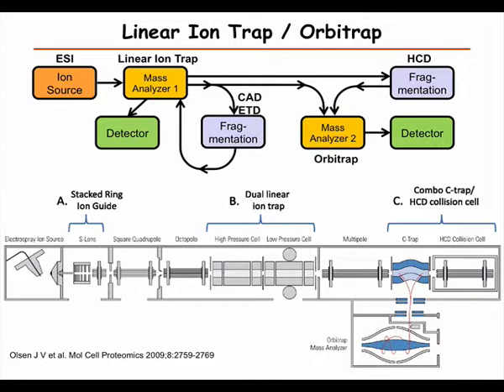Of course, yeah. I mean, most modern cores nowadays probably would have an instrument like this. Not all of them, but a lot of them have it. So definitely the choice of the instrument is something that even the end user, without knowing anything about mass spec, should at least know about. Yeah, I mean, it's a good idea always.